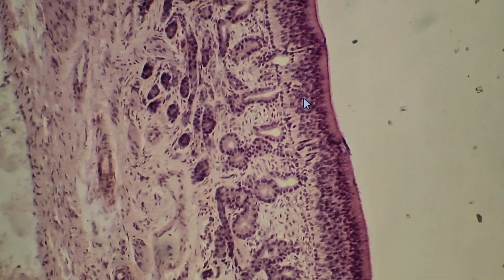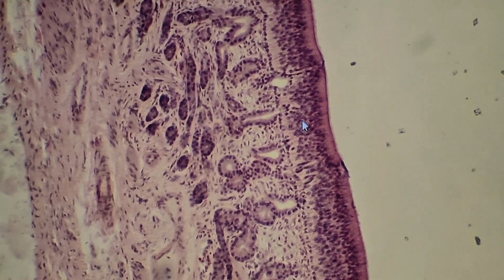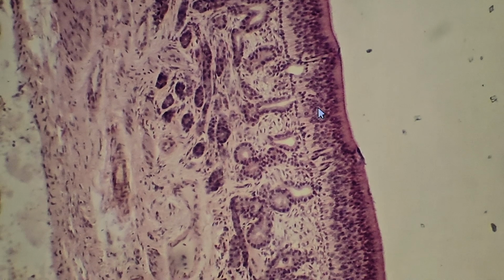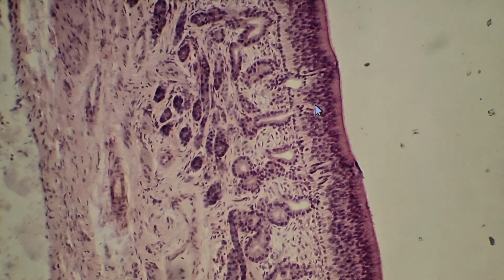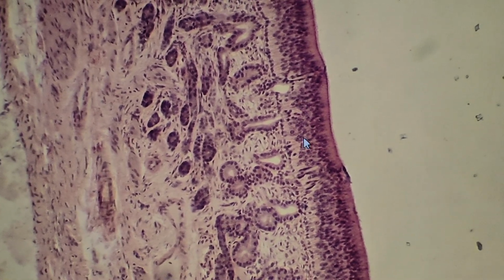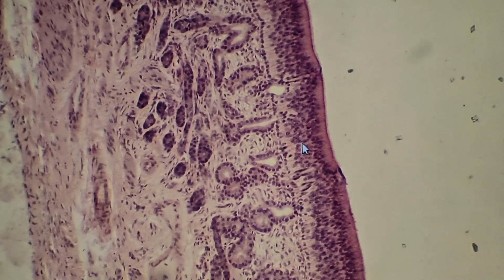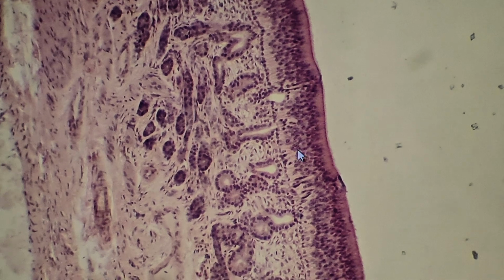The second type is bipolar neurons, also called olfactory neurons. Olfactory neurons form an irregular row near the middle of this thick epithelium. This is the middle region of the olfactory epithelium. We can see the nuclei of olfactory neurons.